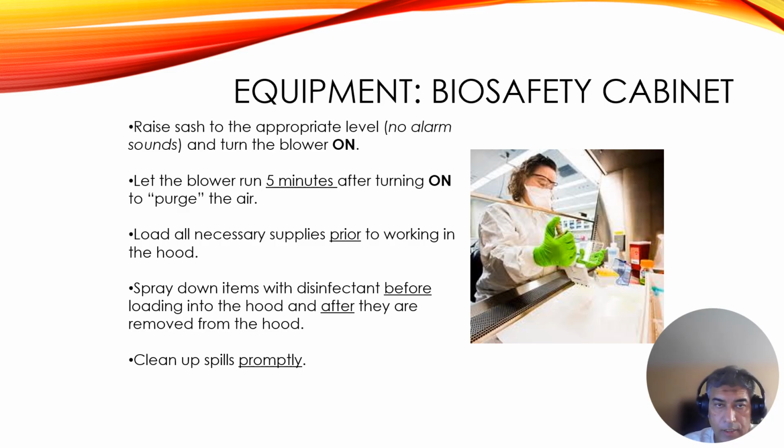Load all necessary supplies prior to working in the hood. Going back and forth to bring pipette boxes, pipettes, culture medium, tubes, or flasks will cause contamination. Spray down items with disinfectant, especially 70% ethanol, before loading into the hood and after they are removed from the hood. Clean up any spills promptly, because cell culture medium especially is the most favorable food for bacteria and other growing contaminants like mold.